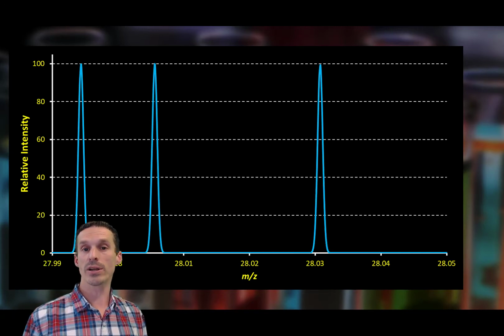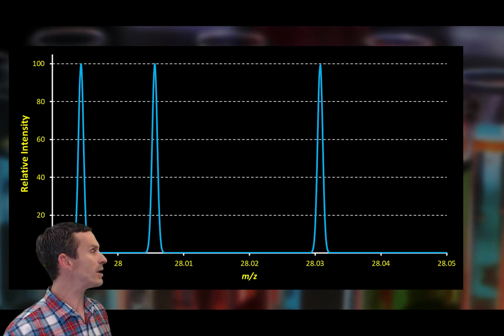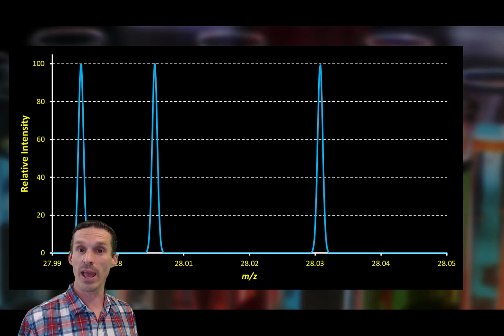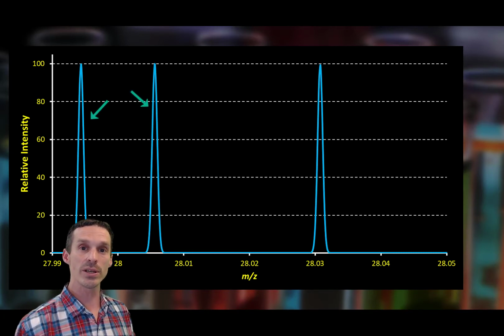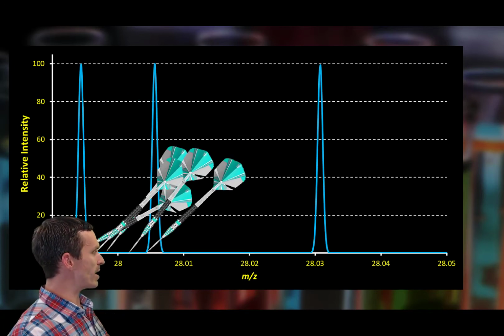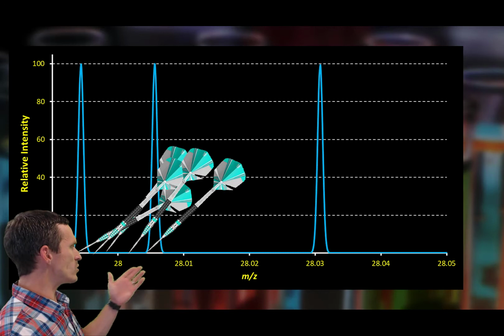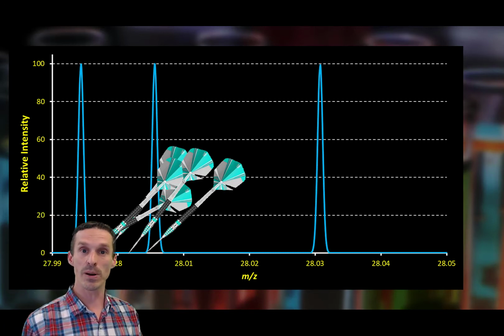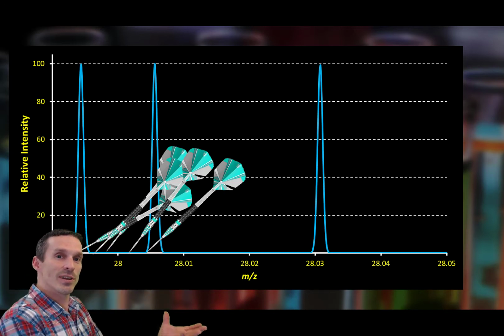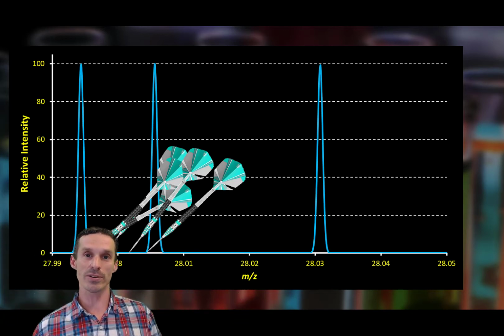And I guess the question comes down to, well, where is the closest point? I mean, it seems pretty easy to distinguish the one way off the end there, but it's the two that are close to each other. That's what we're interested in. Especially if our measurement happens to lie kind of right in between the two, like which one of these two peaks is that corresponding to? Well, at least if we said it's sort of clustered to one side more than the other side, then I think we'd have a better chance of it.